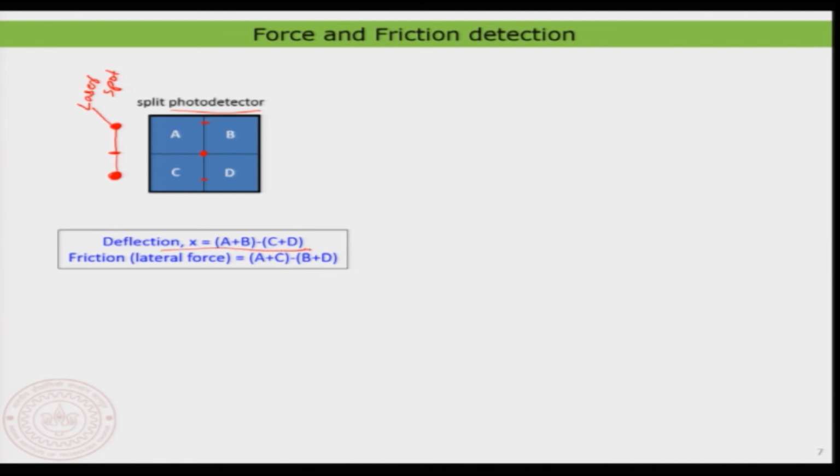I have to basically just see the deflection by taking the photocurrent, because as you go further away from the center, the photocurrent basically increases. That is indicating the kind of deflection that I have, in typical nanometers. So then I can actually calculate that deflection using this.